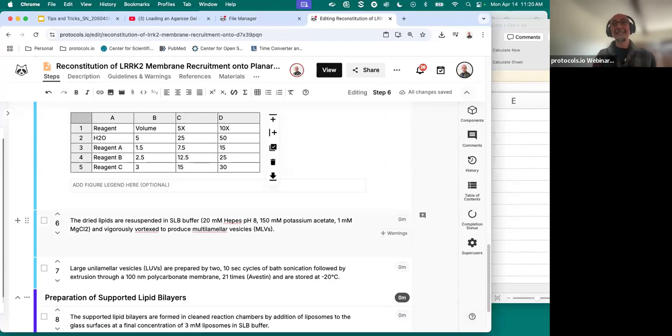There's another sort of table in protocols.io that we call a smart component. A smart component is an actionable table that will capture values during a run. Again, we will use some components like amounts and timer in the run. This is another component to be used in the run. It is called the smart component.